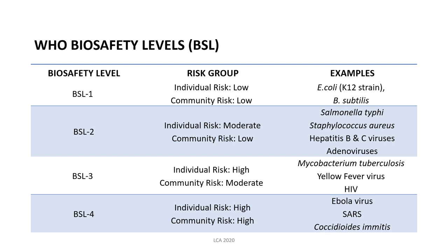For BSL 3, this includes working on pathogenic microbes that can cause serious disease through inhalation. For example, we have Mycobacterium tuberculosis — the causative agent of TB — yellow fever virus, HIV, and West Nile virus. There is a high risk for an individual to contract diseases caused by microorganisms classified under BSL 3, and for the community risk there is a moderate possibility of acquiring the causative agents.